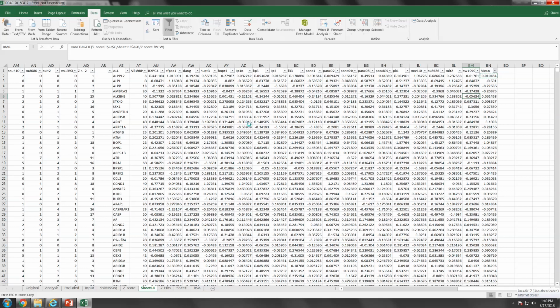In the next few videos, I'm going to show you how you can also use the other two methods, RSA and RIGER. And how do you decide which hit methods to use? If you want the most stringent analysis, you can always use all three.